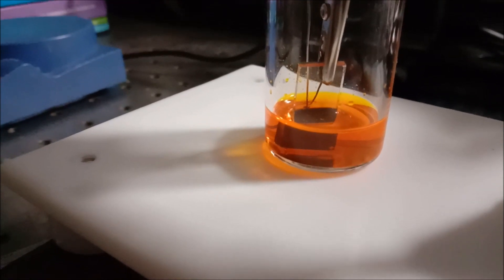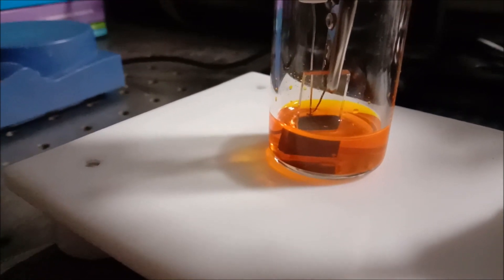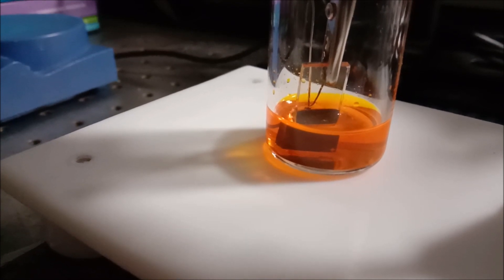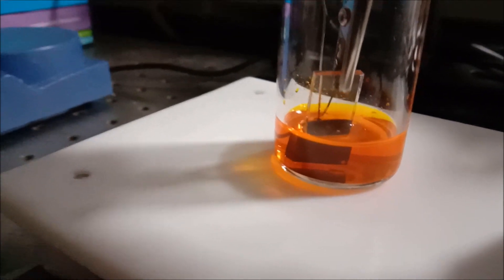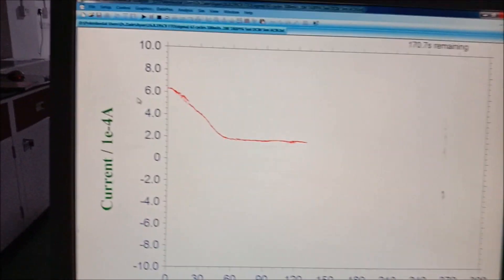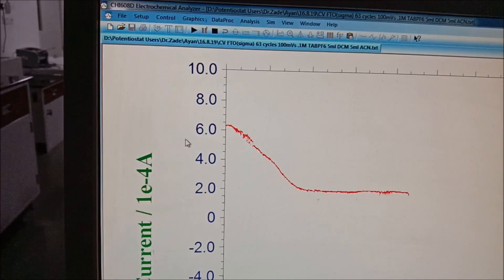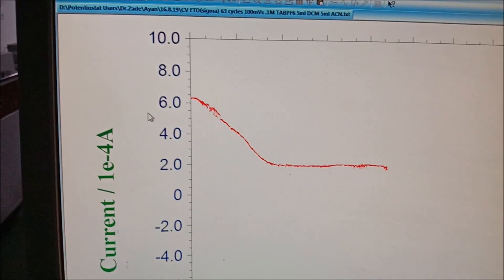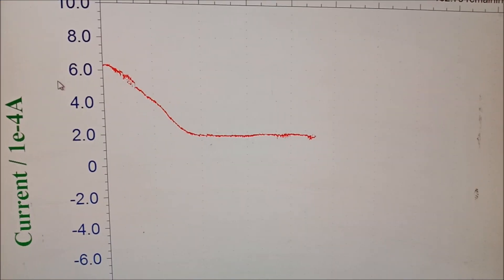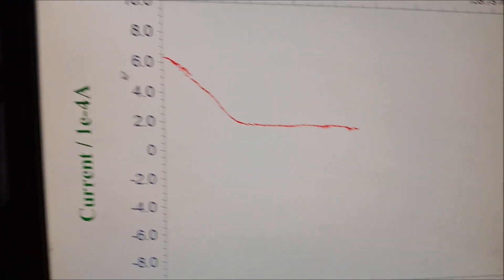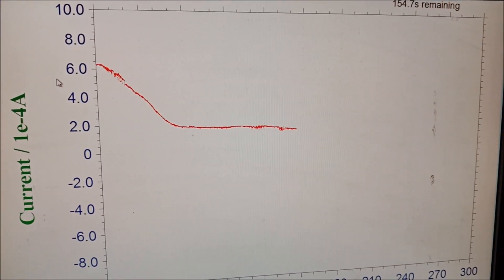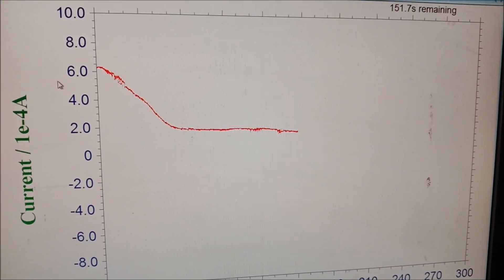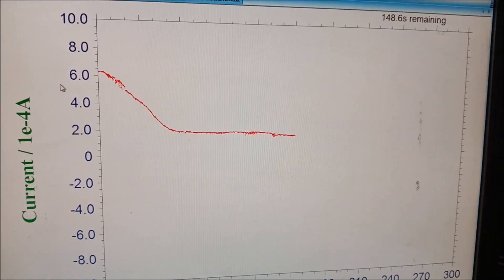I don't know much about electropolymerization, still I think amperometric IT or chronoamperometry are the best techniques for this. You can see here the current value. It was higher earlier, now it has decreased and is being saturated because the film formation I think has finished.